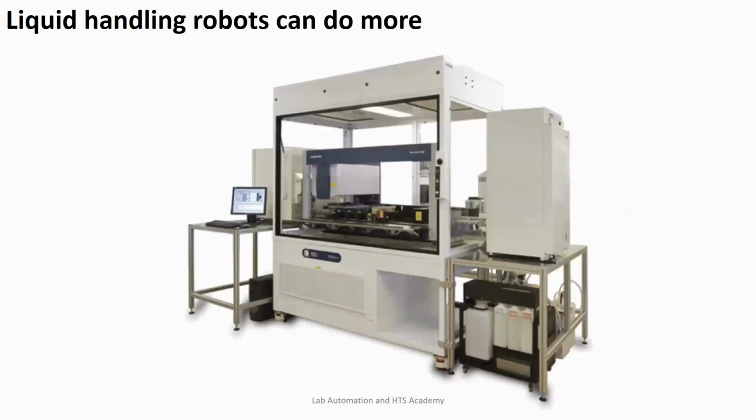Okay, then they call liquid handling robot. So we expected that they just transfer liquid from one place to another. But in reality, these days, liquid handling robots are like a heart of a platform, a workflow. You can integrate a liquid handling robot with different tools. For example, here on this picture, we have a plate incubator, we probably have some plate washer, and we have a microplate reader, all of them being integrated with the liquid handling.